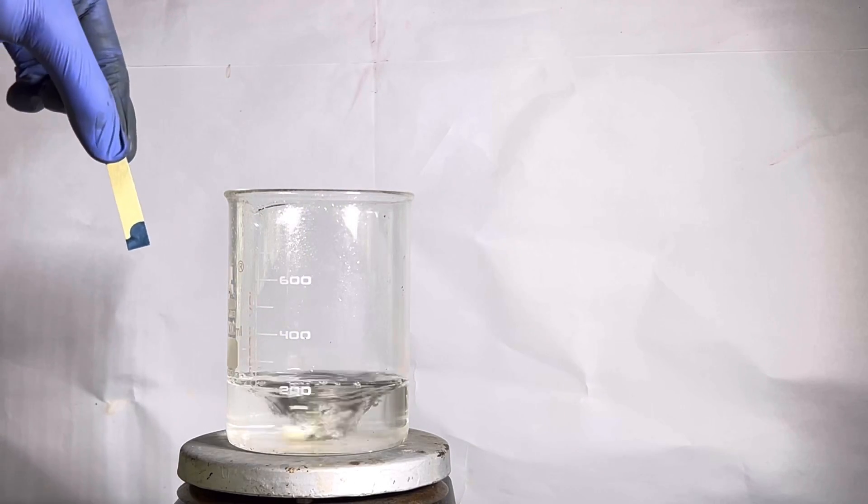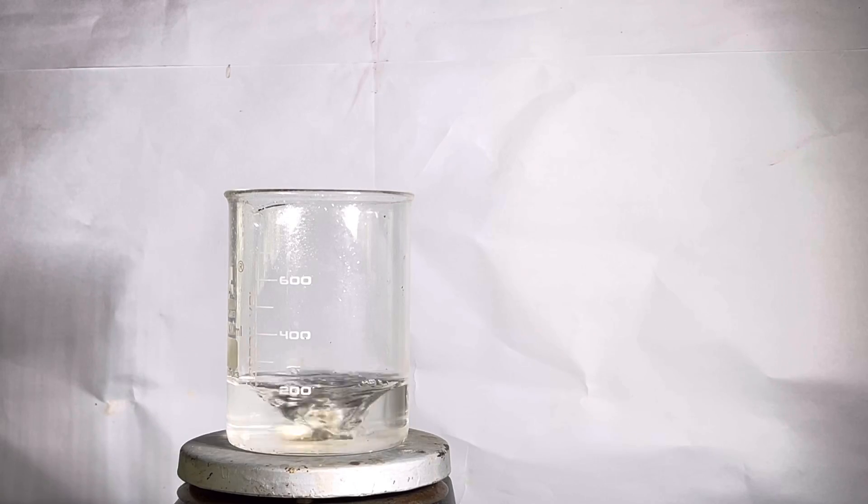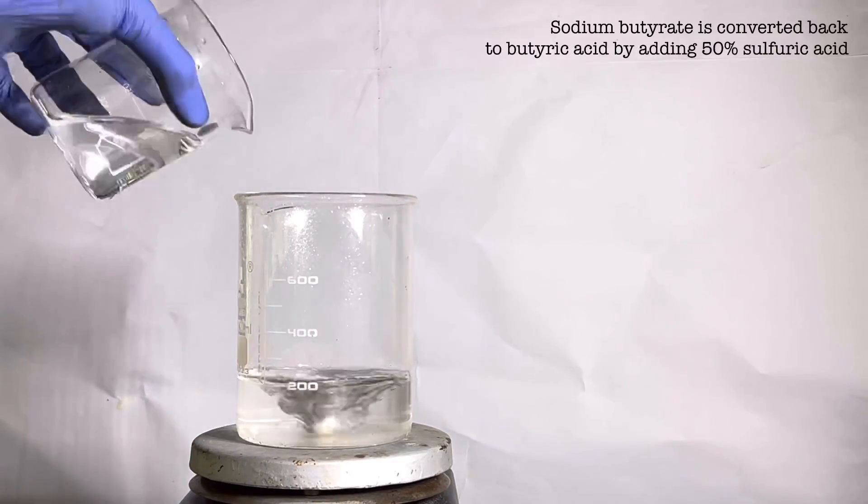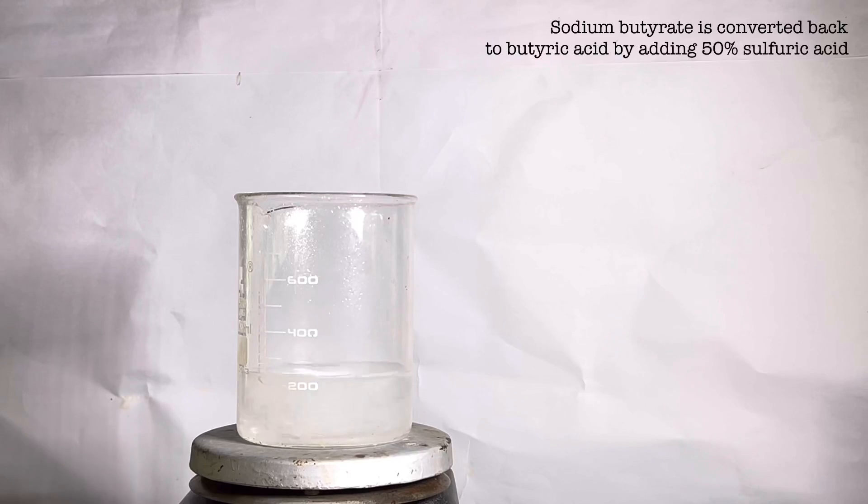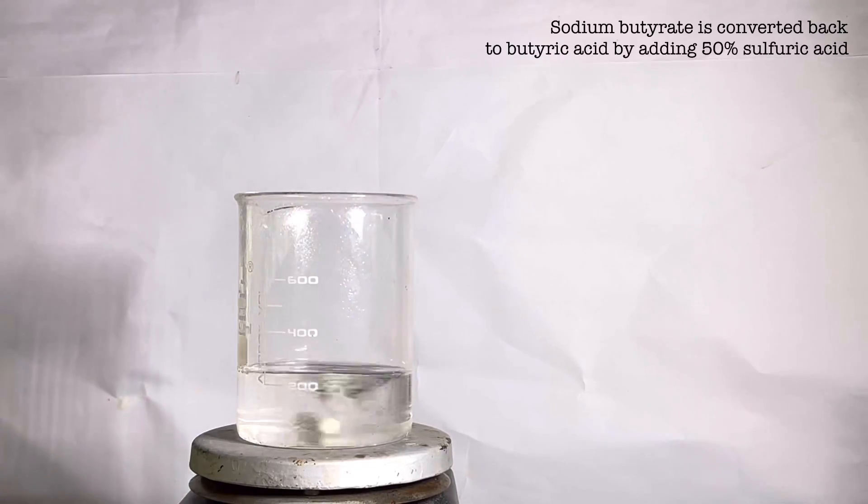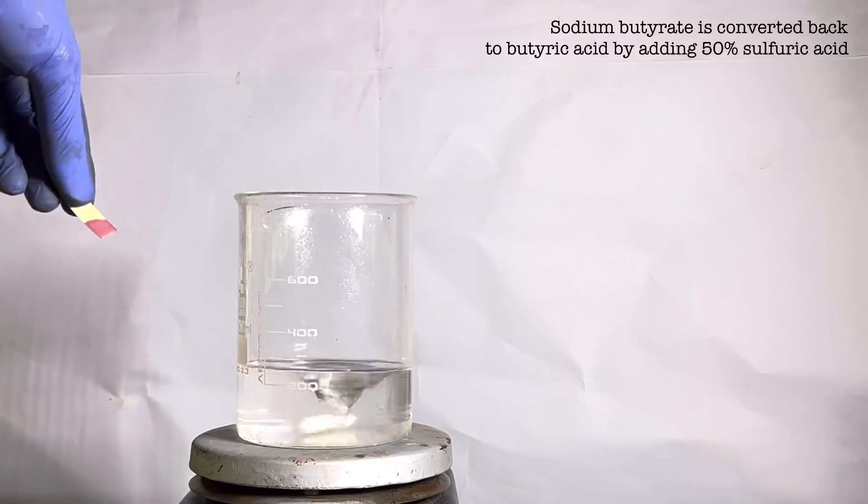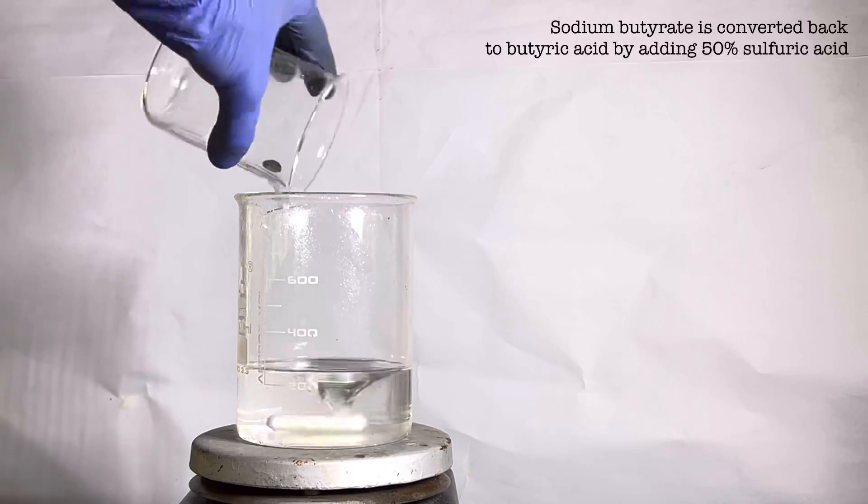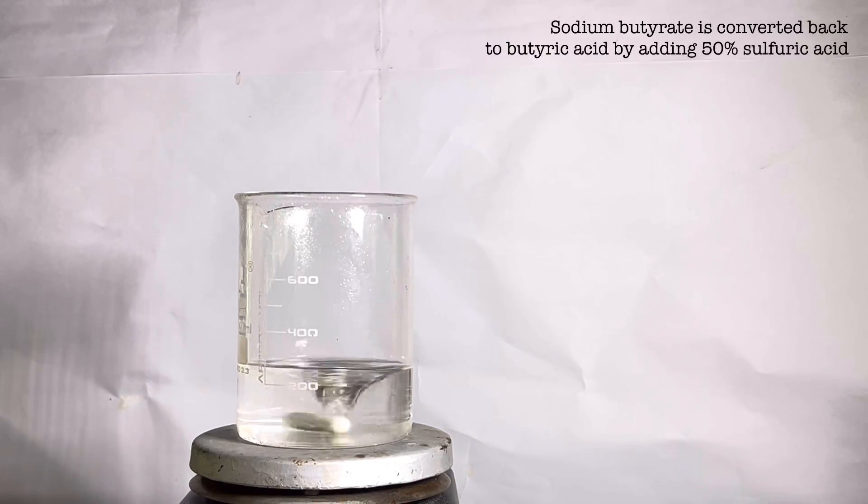Now we will convert the sodium butyrate salt back to butyric acid. For that 50% solution of sulfuric acid is added to the beaker slowly. Immediately the stinky smell of vomitus comes into the environment. The smell is so natural that it would really make you nauseous. Keep adding the sulfuric acid until the solution is acidic confirmed by the pH test. Now the butyric acid is almost in pure state with very less impurities in the aqueous phase.